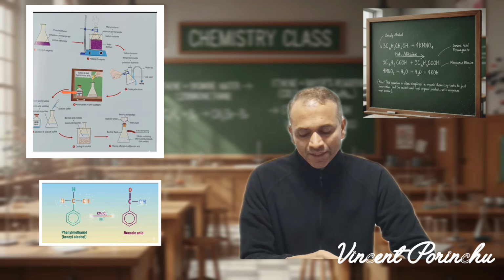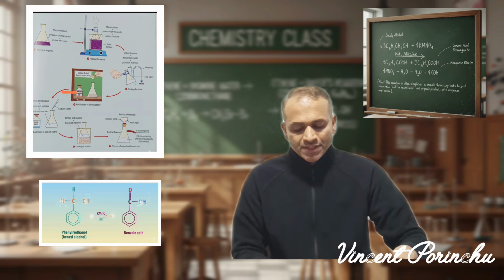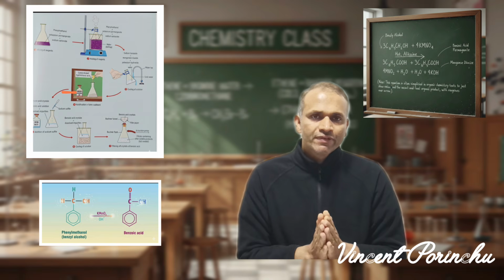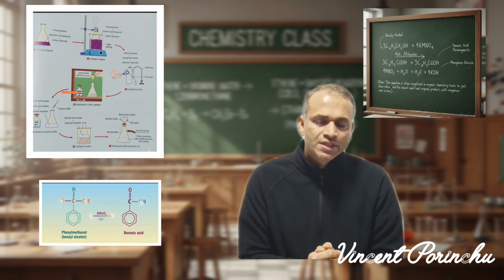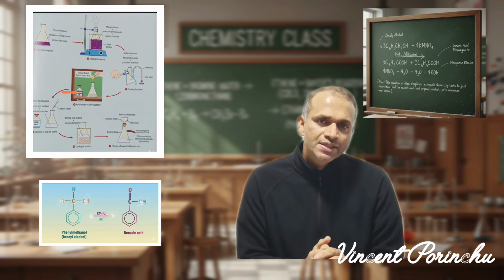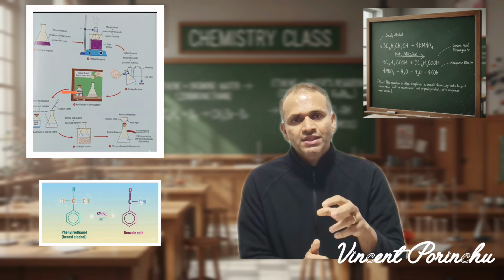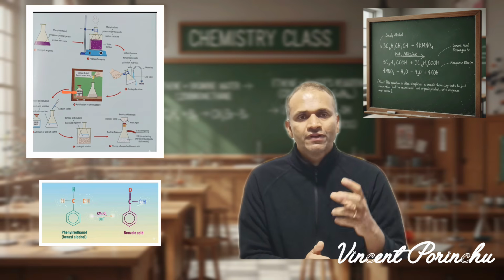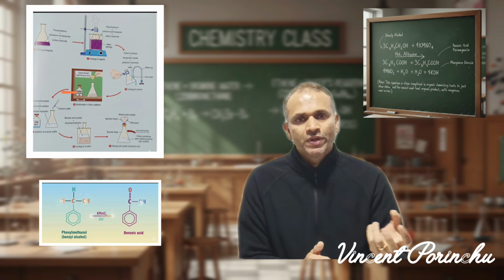So we are adding in the 5th step the sodium sulfite. Sodium sulfite will reduce manganese dioxide. Manganese dioxide is the reason the content of the conical flask became brownish in color.